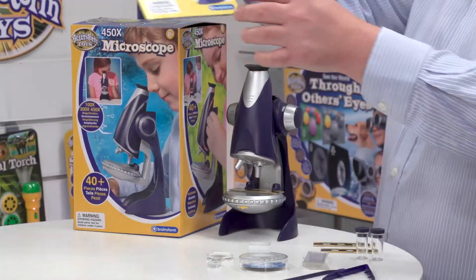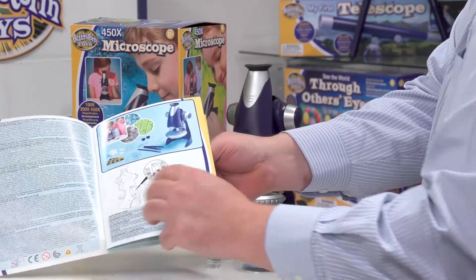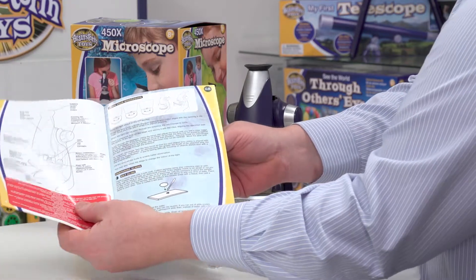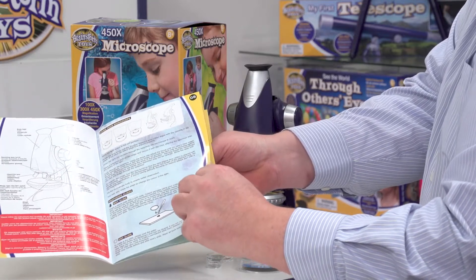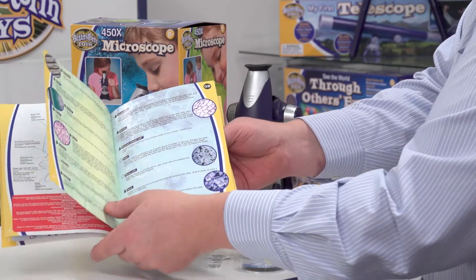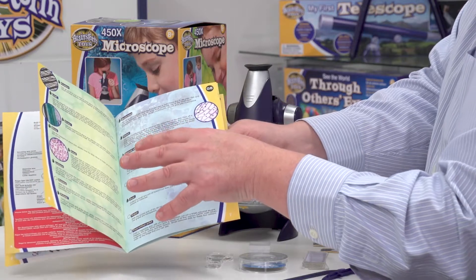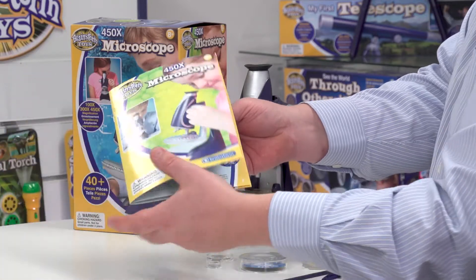When you take everything out of the box, you'll see that we've got an instruction booklet here. You'll see there are instructions about how to put the batteries in, also a diagram for the different parts on the microscope. There are also instructions about making your own slides and some suggestions for slides you might want to make. This is a really good thing that mom and dad or grandma and granddad could do with the kids — a really great item.